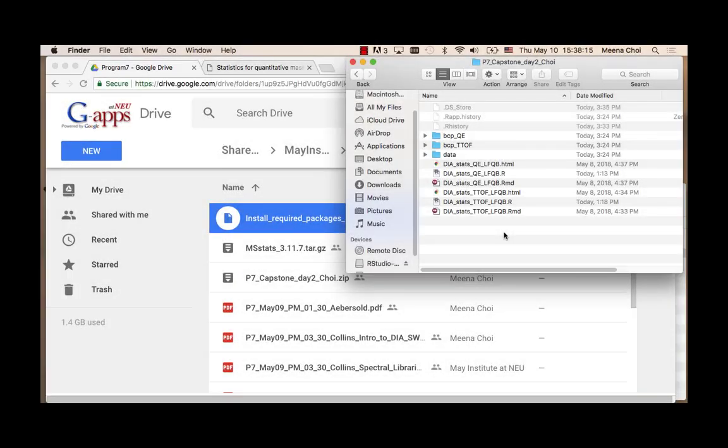So we're going to practice how to use MSstats again with the example data you practiced this morning. You already used the group comparison function in Skyline, but we are not going through it that way. We just export the MSstats required format and then go through the whole MSstats analysis in R itself. So if you have any difficulty, please let us know. The TA will help you.